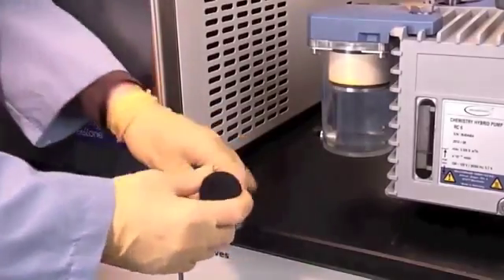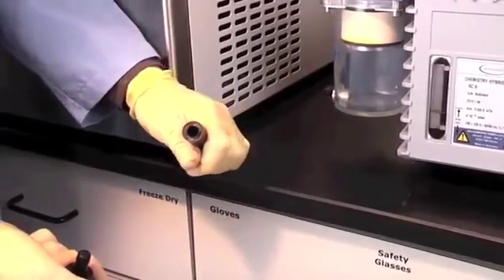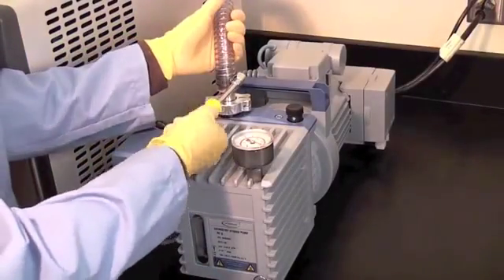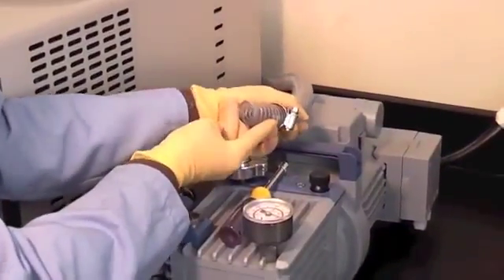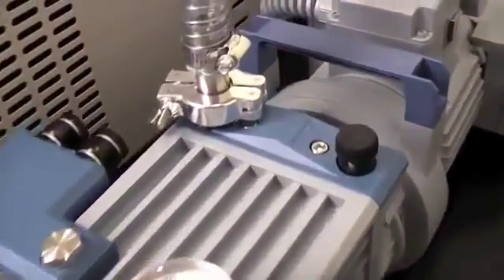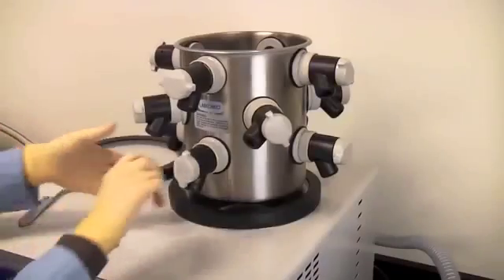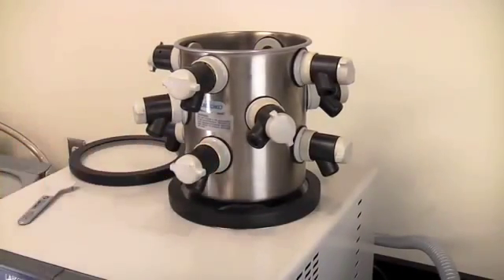Check the drain line for leaks and ensure the drain plug is installed and the tube is in good condition. Check all rubber vacuum tubing for signs of deterioration or cracking. Check all connections and make sure they are secure and leak-tight.